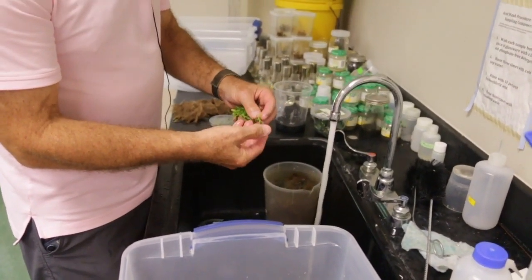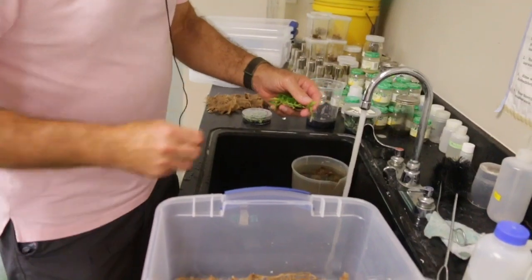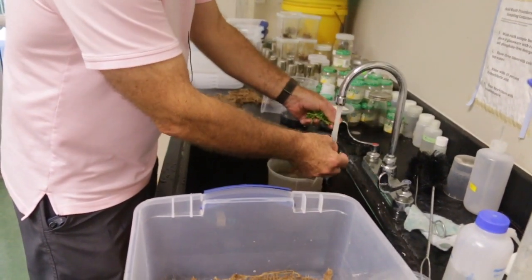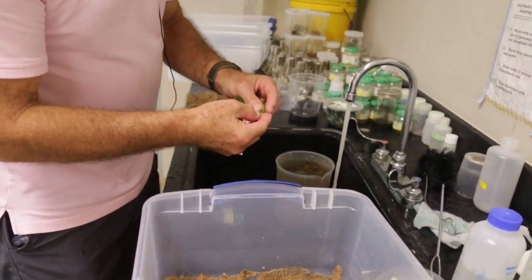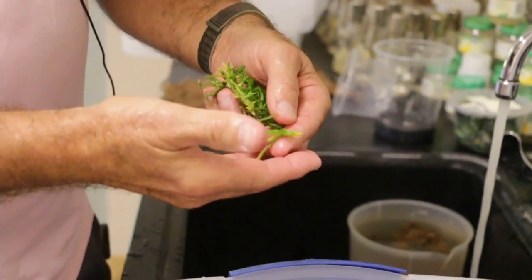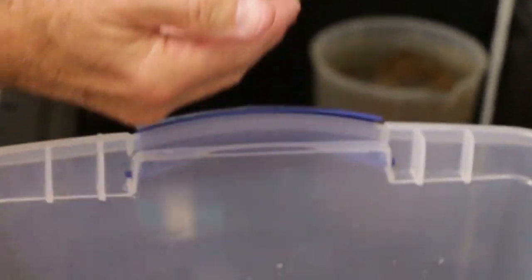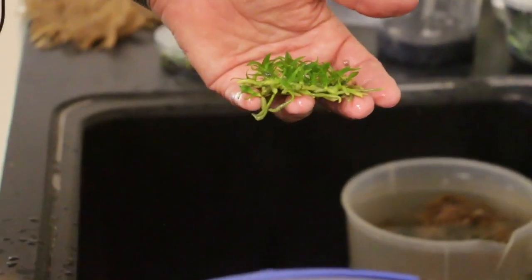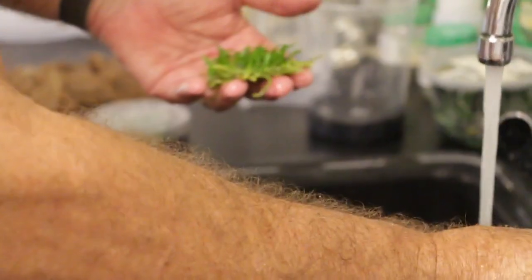So what else we could have done with these orchids is just autoclaved them and tossed them. That was their other fate. So these are really tiny for deflasking. And you want to make sure, again, that you get as much of the medium off the roots as possible. And I'm feeling this, that's a little too hot.